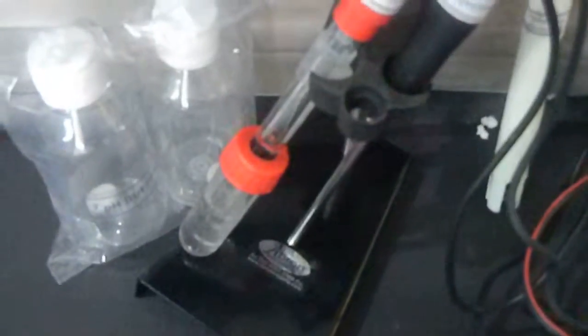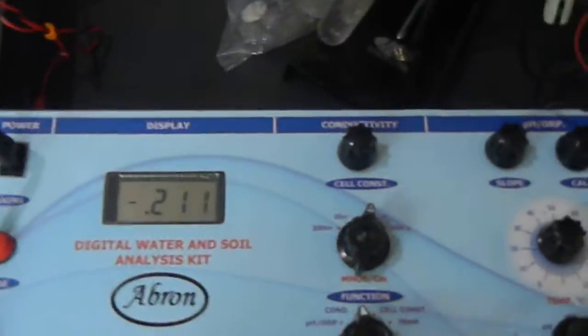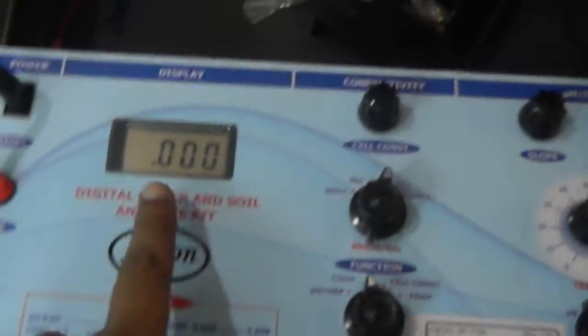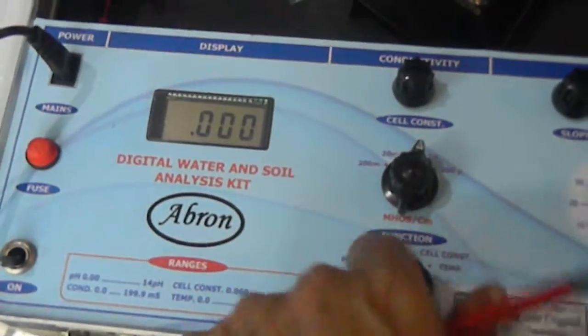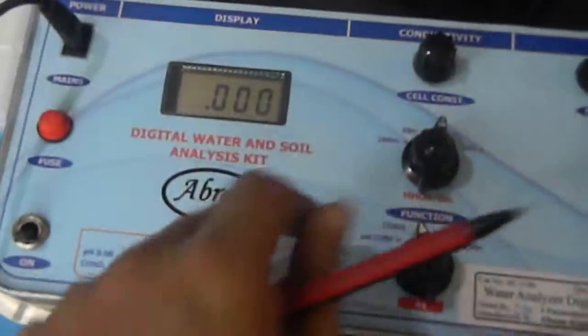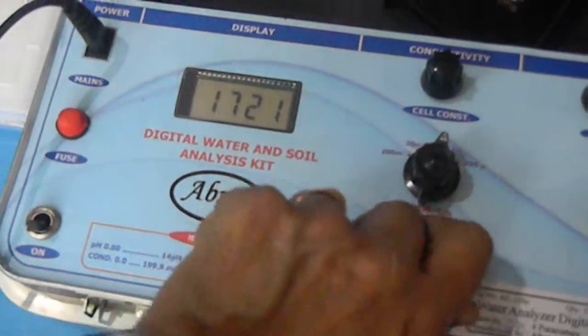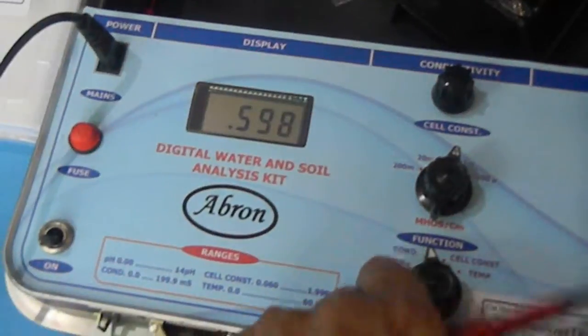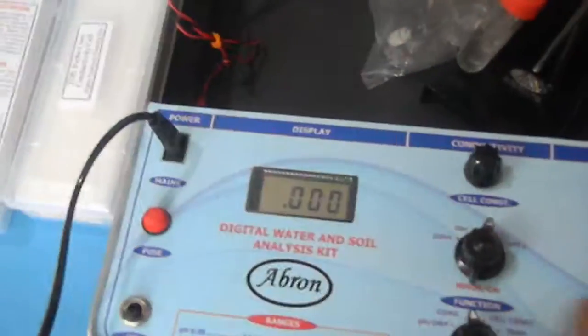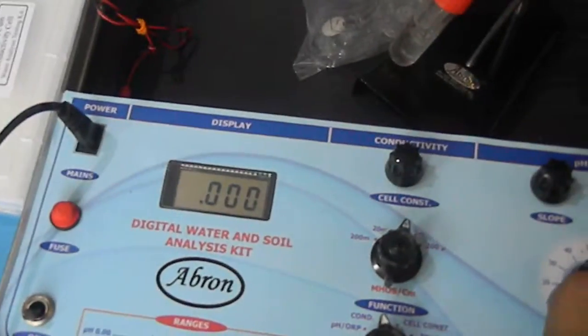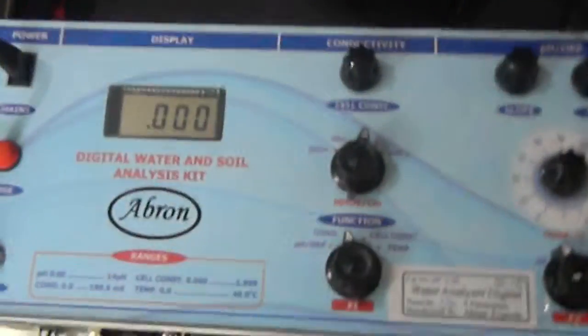Then to start with, you select this conductivity mode. When you go with the conductivity mode the value is visible. This mode gives you the conductivity.